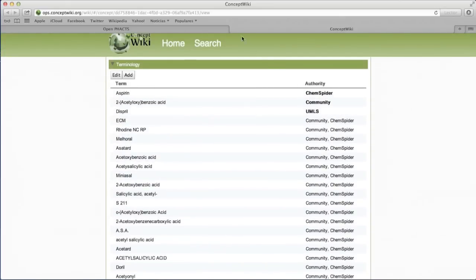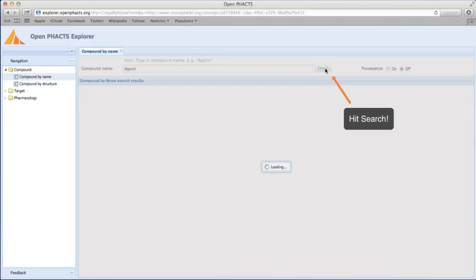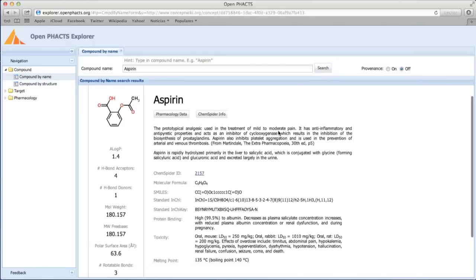We now return to the Explorer window, where we will hit Search. When the query has been processed, the results are displayed as a one-page compound report card.